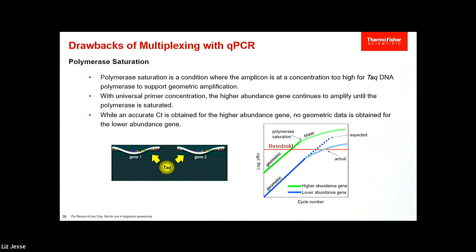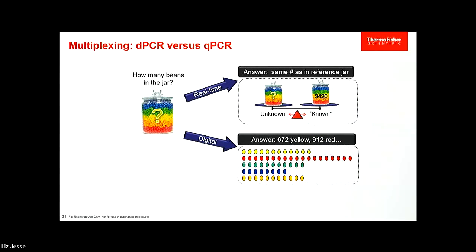In a digital PCR situation, we are essentially taking our toddlers and spreading them out into an individual sandbox of their very own. Now they're happy and they don't have to compete. And so we give them as many toys as they possibly want to play with so that they can do their amplification at 100% efficiency.